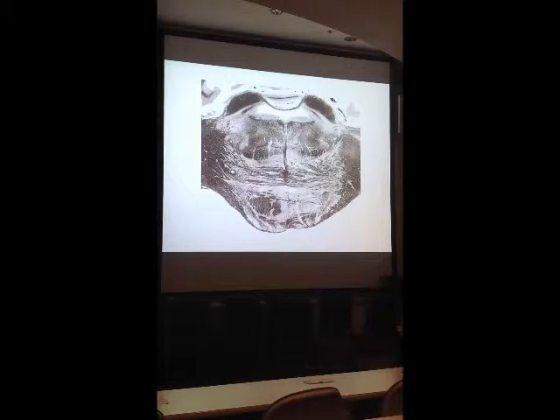there's a couple of cranial nerve nuclei here that we've identified for quite a while that I said I'd like you to be able to remember. This is the level of pons where the fifth nerve comes in and out of the pons. And at that level of the upper pons, this nuclear territory makes up the chief sensory nucleus of the fifth nerve, also known as the pontine trigeminal nucleus. I think in the atlas he calls it the principal trigeminal nucleus, and that's fine too. These are secondary neurons with the fine touch, vibration, and proprioceptive pathway for the inside face.